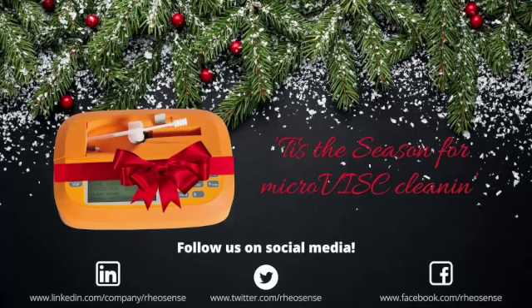Yeah, definitely. So Zach asked if there was a temperature control option. There certainly is. You can control your temperature between 18 and 50 degrees Celsius. Essentially, you just place your microVISC within the temperature control chamber, and you can control your temperature within that range.